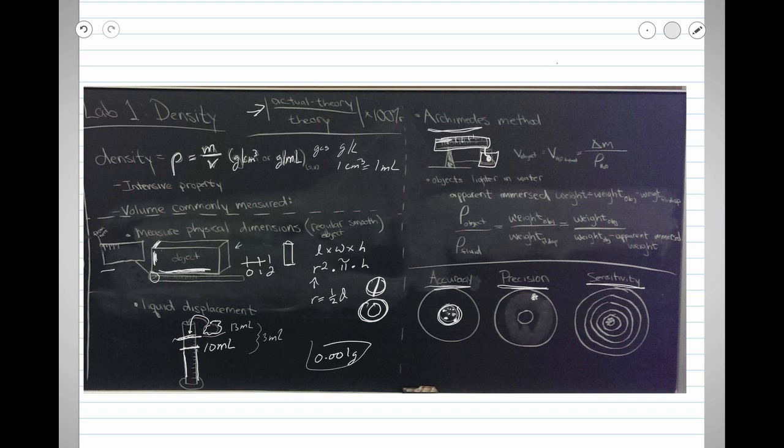Also is sensitivity. So sensitivity is the scale used to measure something. Your ruler might measure to the nearest 1/16 of an inch. I hope not, because it should be in scientific units. But if you had a fine micrometer, it might read to the nearest 0.01 millimeter. There are benefits to using tools that are more or less sensitive. Ease of use, how often they need to be calibrated, that kind of thing is a trade-off for sensitivity. So if I was measuring a Mack truck on a highway, I don't really need to know that to the nearest milligram, so it doesn't have to be that sensitive.